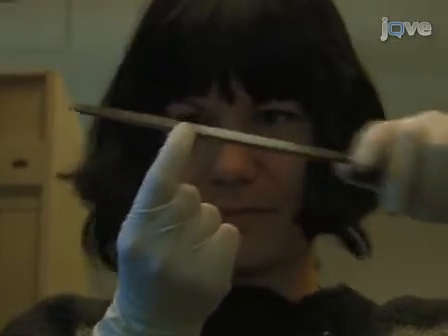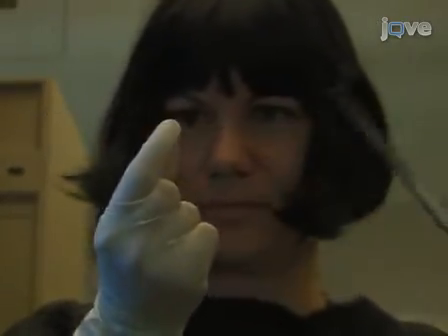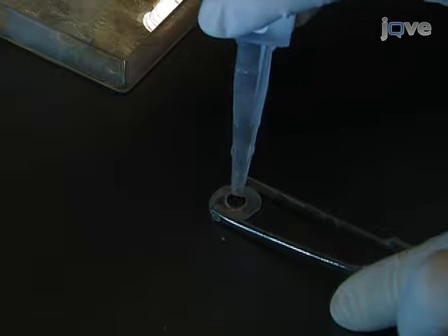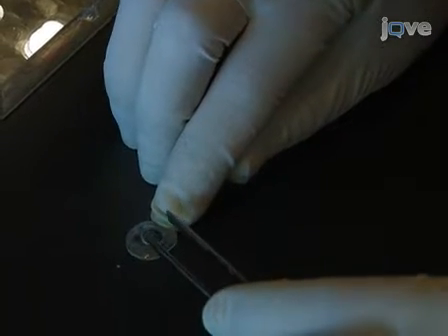File the top of the plastic base to make a flat surface for the glass cover slip. The diameter of the filed flat surface should be 9 to 10 mm. Next, glue the 8 mm circular glass cover slip onto the flattened surface using superglue and let it dry for 15 minutes.